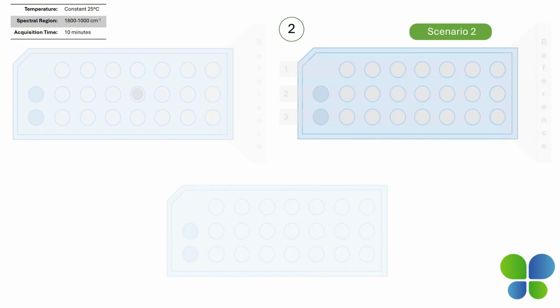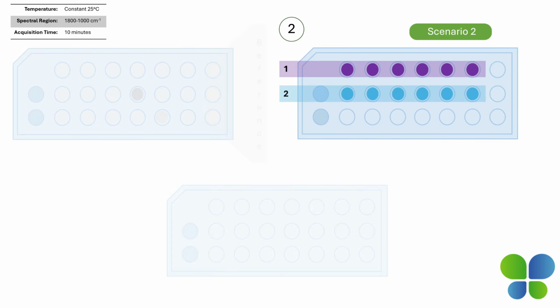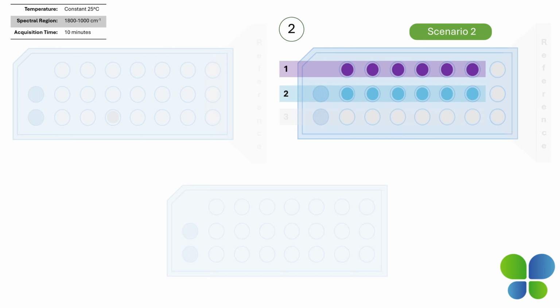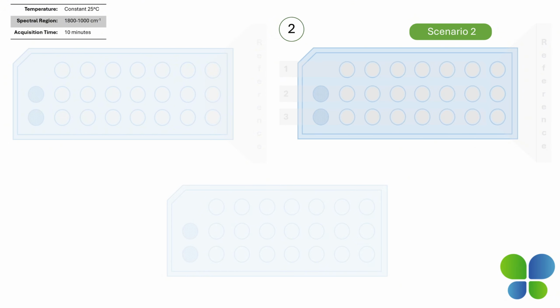The second scenario involves investigating deviations during manufacturing, whereby sampling the drug substance across the downstream bioprocessing workflow to identify risks through a multi-attribute comparability assessment. This information is critical, enabling a process control strategy to mitigate risk.